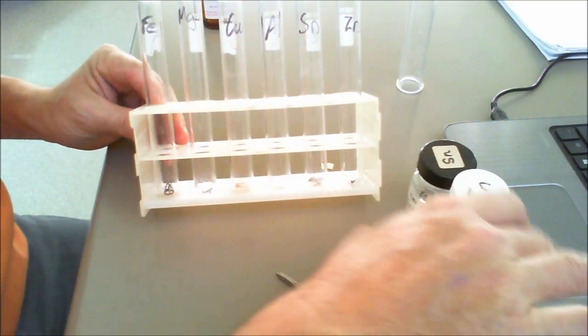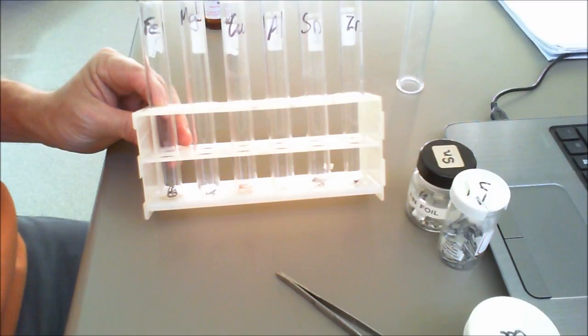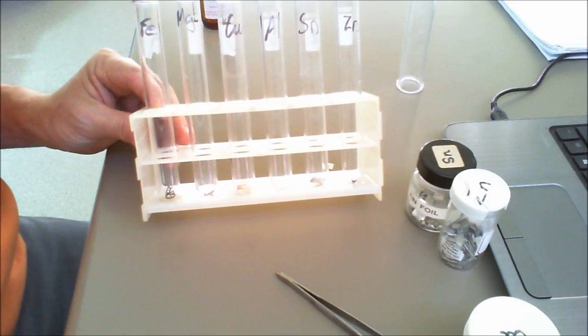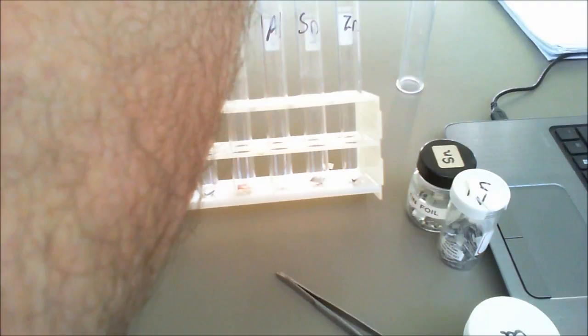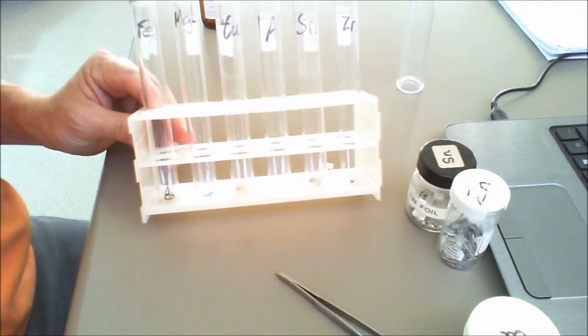So we have iron, magnesium, copper, aluminum—and I forgot to put an aluminum piece in there, so I'll just chuck a couple of aluminum pieces in—tin, which is Sn, and zinc.